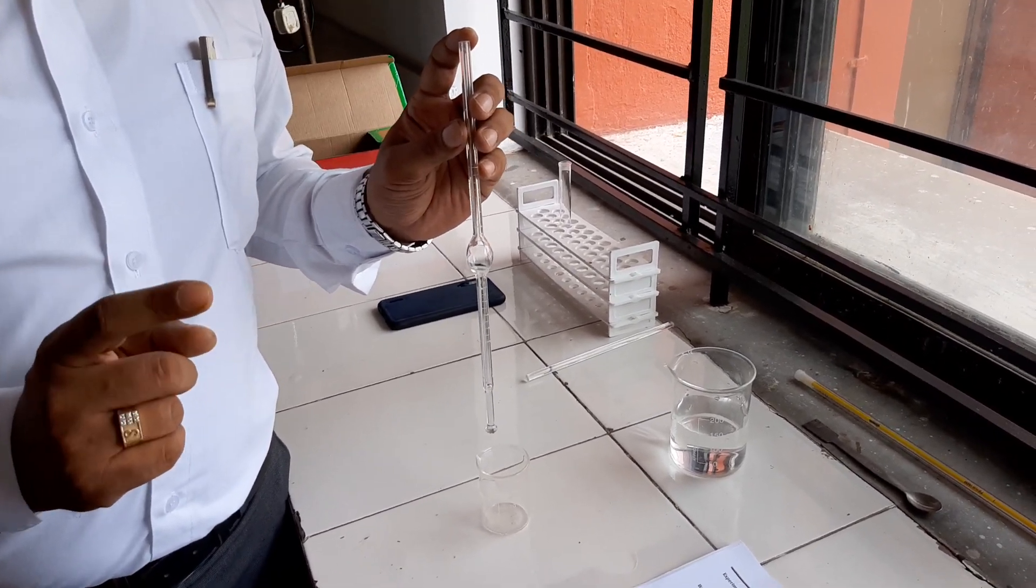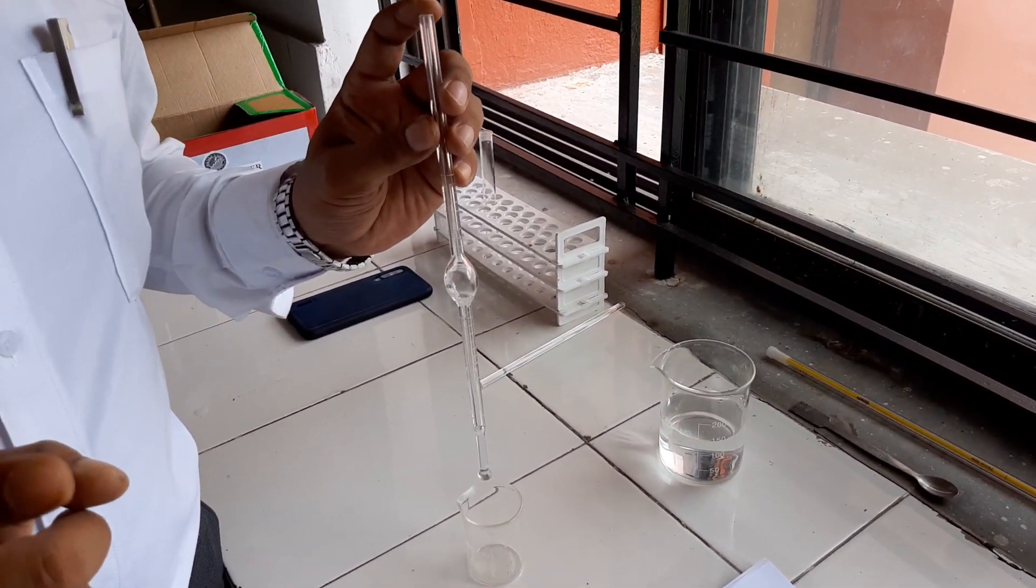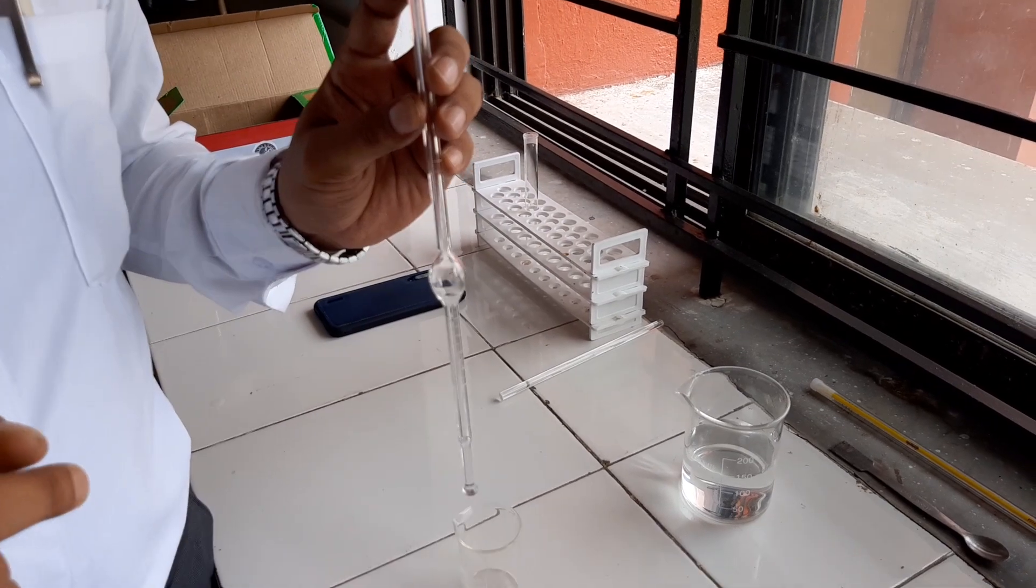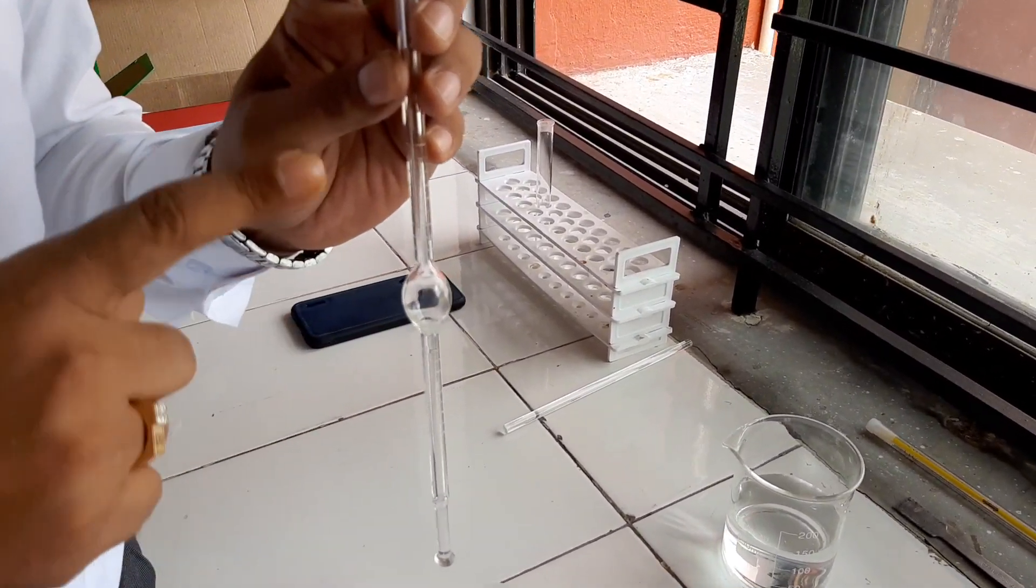Now, we will discuss the determination of surface tension by drop weight method. The same instrument is required, that is stalagmometer.